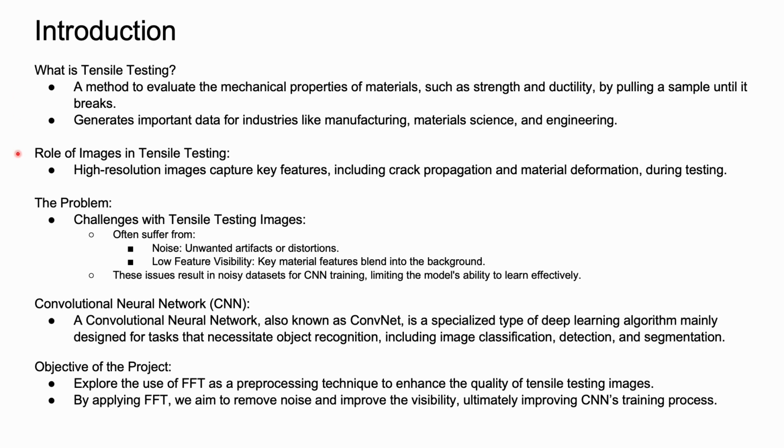High-resolution images are captured throughout the process, showing key features like crack propagation and material deformation. However, these images often suffer from noise and low feature visibility, making it difficult for machine learning models, especially convolutional neural network or CNN, to effectively learn from them.